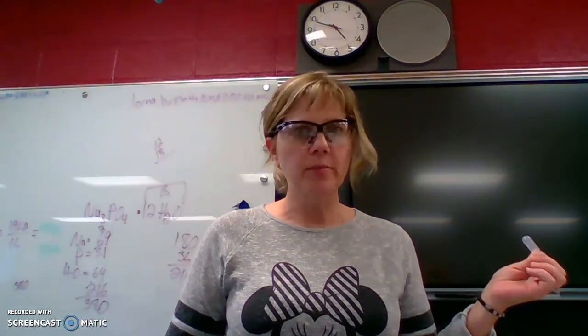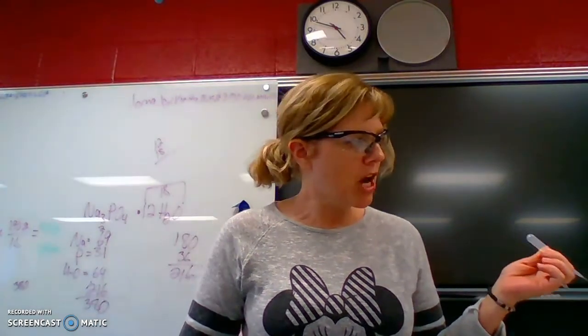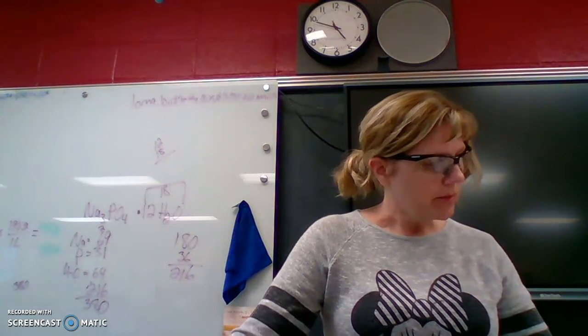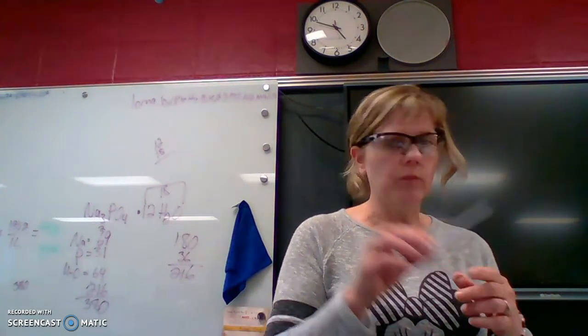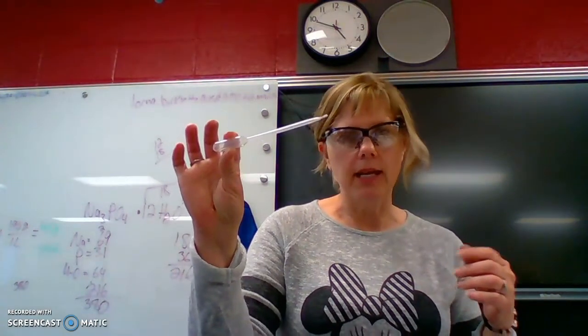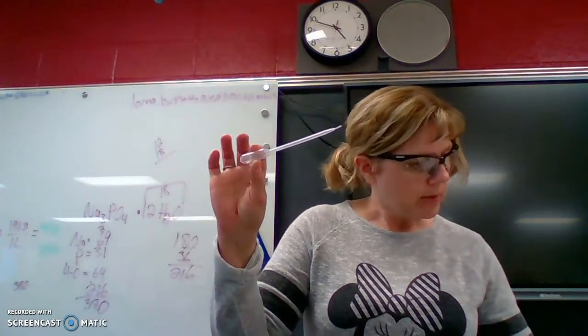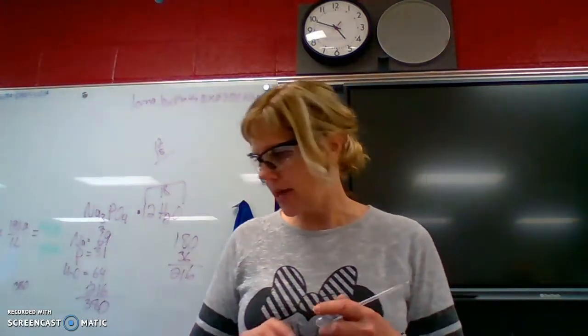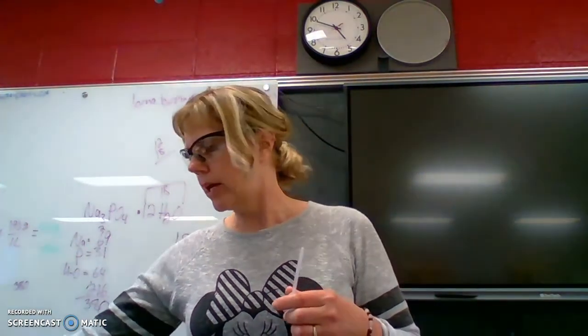All right, reaction number 7, here we go. We're going to keep zipping along. Reaction number 7 says, I'm reading it right from your sheet, using a barrel-type pipette, whenever they say barrel-type pipette, they're talking about one of these little guys, and add 20 drops of 1 molar sodium hydroxide. So I have that right here.